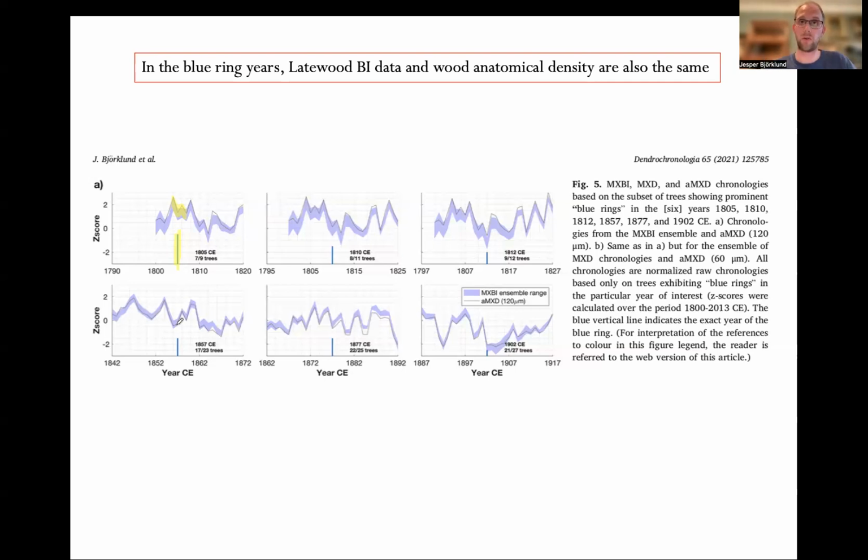So even though the lignin content is demonstrably lower, we cannot see that this has any substantial effect on the blue intensity measurement.